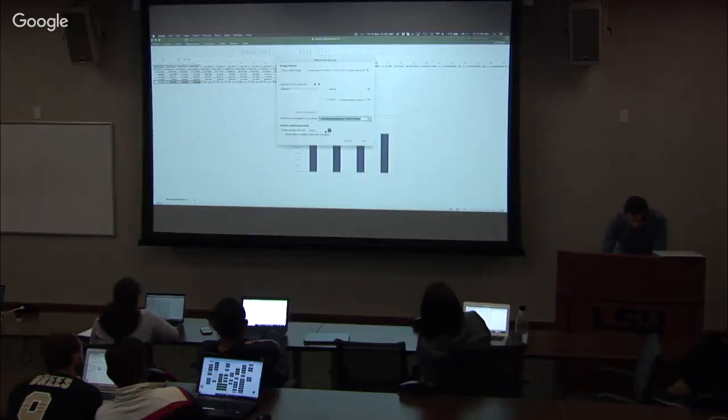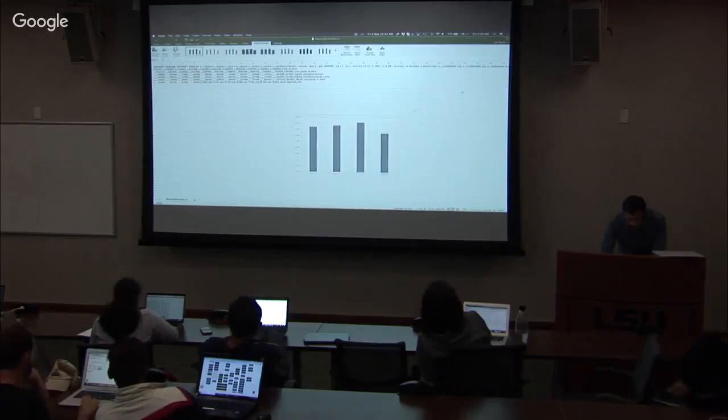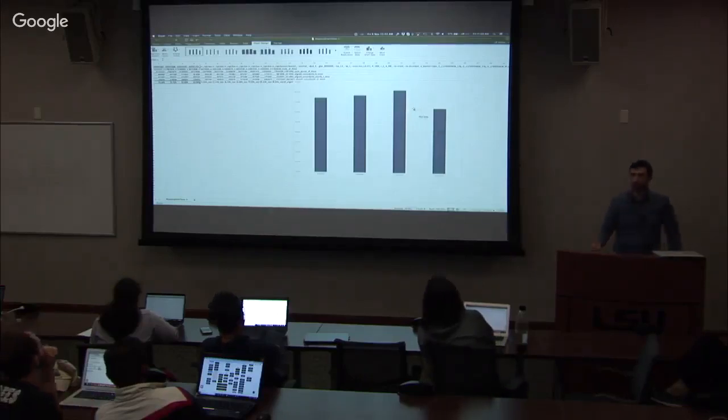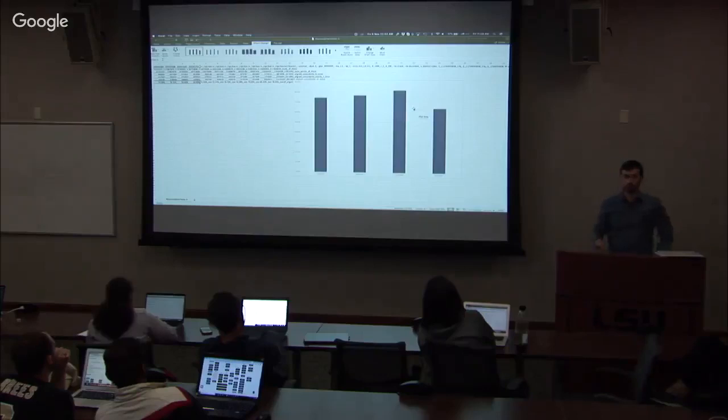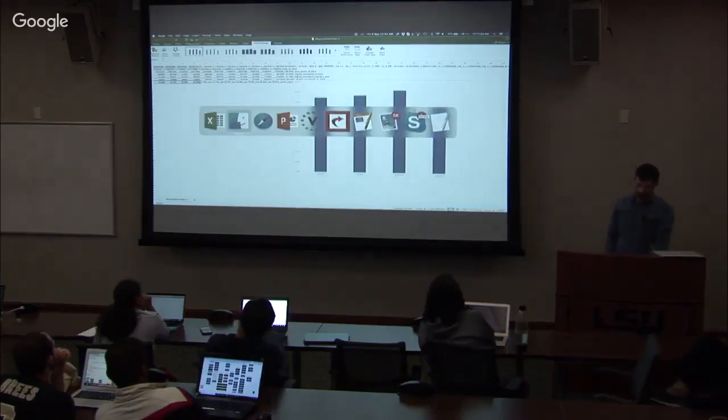Yeah, I mean, you can, of course. So you can see that, for example, there's a difference between these two. And so if I'm just comparing the gene expression between those two samples, I'm already going to be expecting some difference that is not related to the difference in the genes that are being expressed.